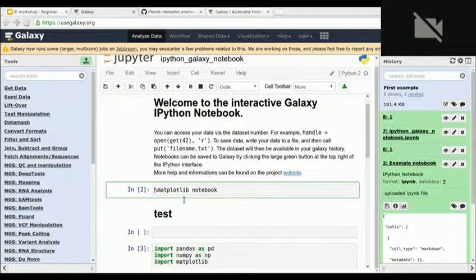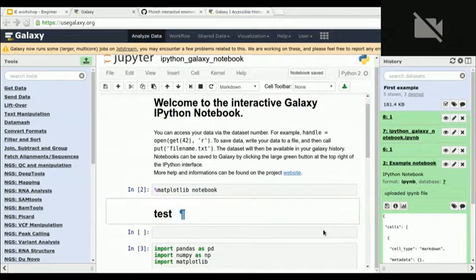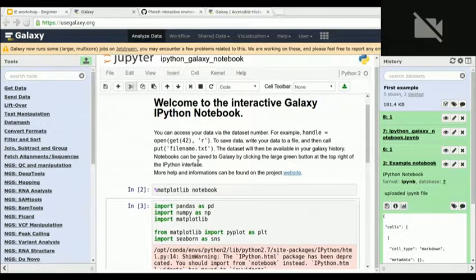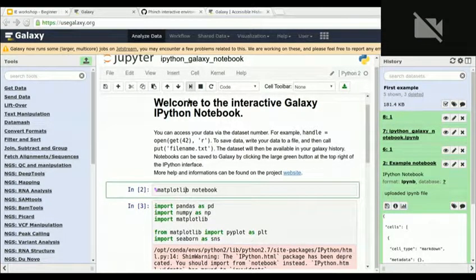Okay. So has anyone imported this history and can see this example notebook in the history? Can you open it, please? So it should look more or less like that one, besides this text screen. So it should look like this. Yeah. Okay, so this is what I shared with you. So this is my code. And now you can replay. So try to, this is the first cell, and try to just execute.